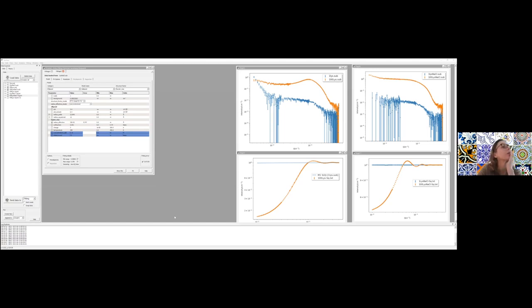I don't think there is that option. Good question. I'll ask the developers to have an option to just import those parameters. They're going to tell me it's a dangerous option to have because then people don't check their input values. But you're right. If you have, I don't know, if you have 50 samples, then it's nice to not have to type.